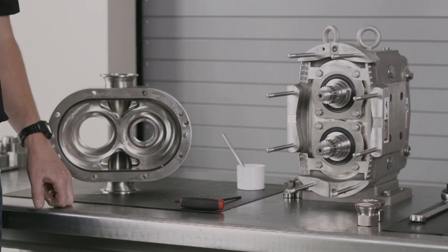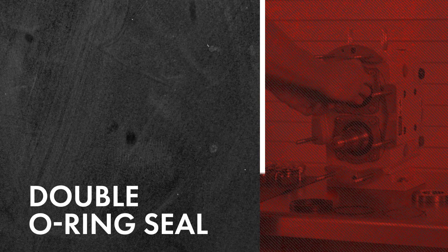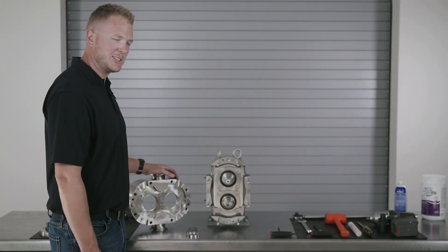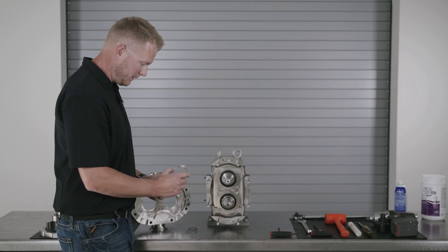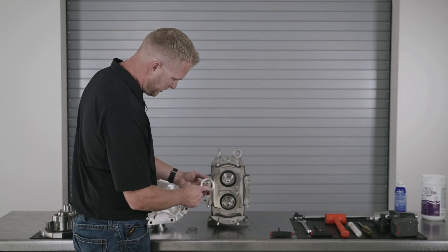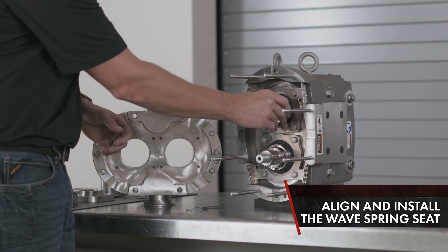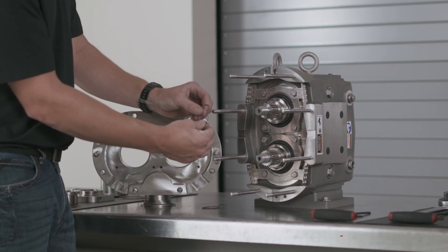That concludes the single O-ring seal on the Universal 3 PD pump. Next, we're going to cover the double O-ring seal on the Waukesha Universal 3 PD pump. You've got your wave spring seat — notice your two flats align with the two flats on the shaft. Install and make sure it's seated. Now you have your wave spring; install on the shaft.